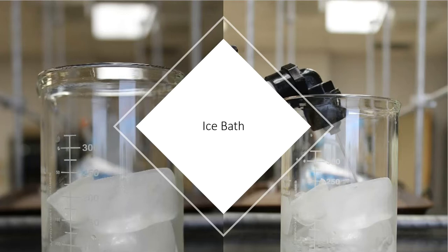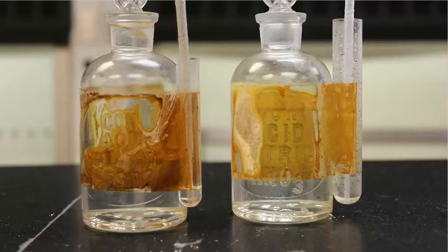All right, so there's my ice water bath, which means that I also need to go to our cabinet and I need to get our concentrated nitric and our concentrated sulfuric from the lab drawers. All right, now the lab cabinets. So here's our concentrated acid jars.